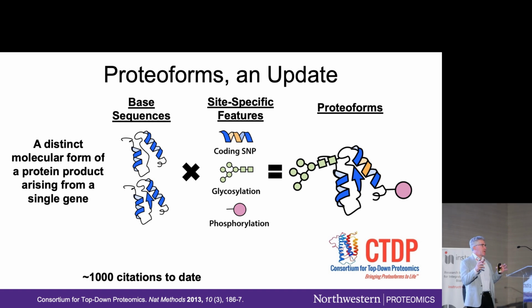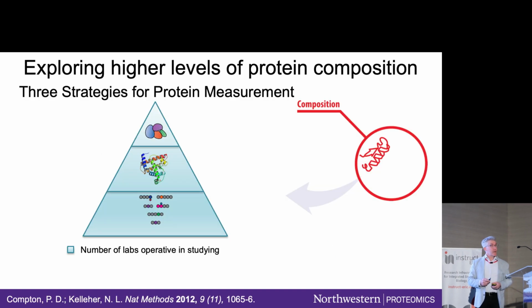And there's a worldview problem here, that when you see PTMs and you see so many in mass spectrometry-based proteomics, they're so proud of having shown you our field created tau with 65 phosphorylations on 6 isoforms, and you're like, okay, so which ones are functional? Those who do proteoform analysis have a different worldview, by and large, that all those 65 phosphorylations can't co-occur. That's just too many ATPs burning, and evolution would not have created that inefficiency. So when you think about high stoichiometry co-occurring phosphorylations, those who do this kind of analysis see a much more tractable landscape, and therefore a straight line to a big science project.